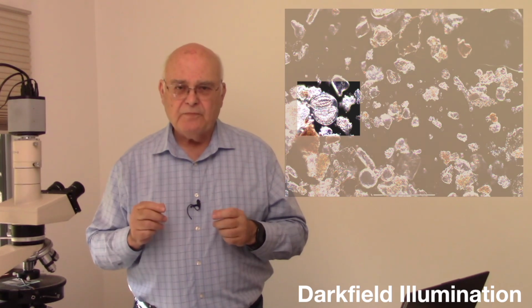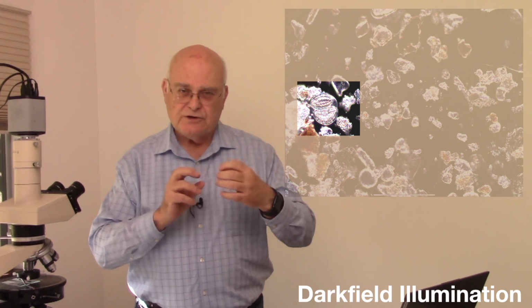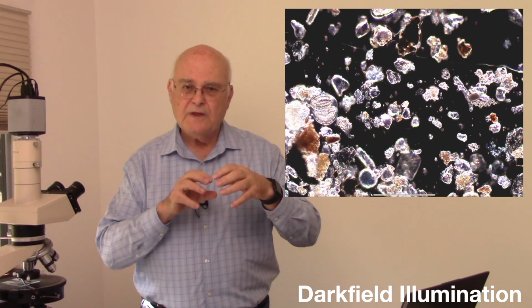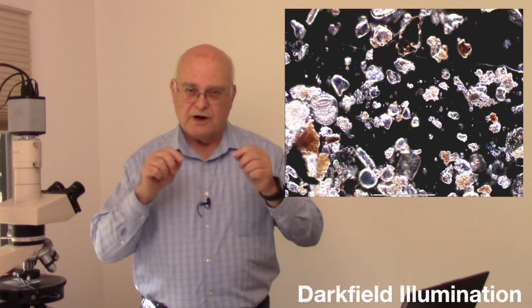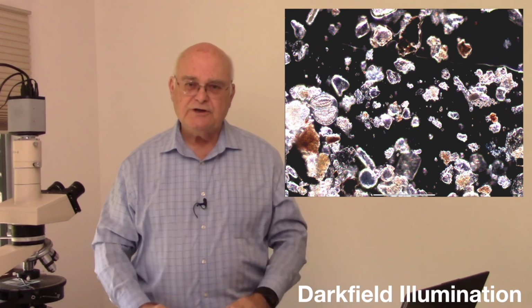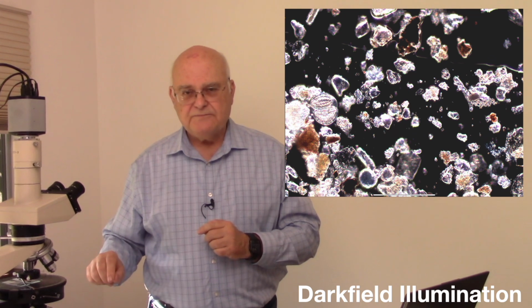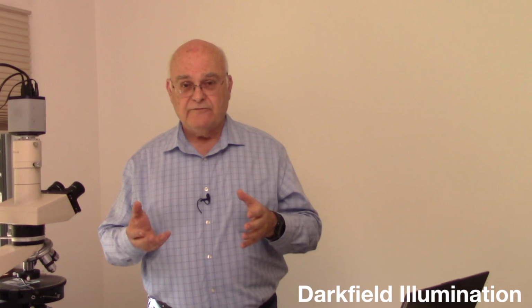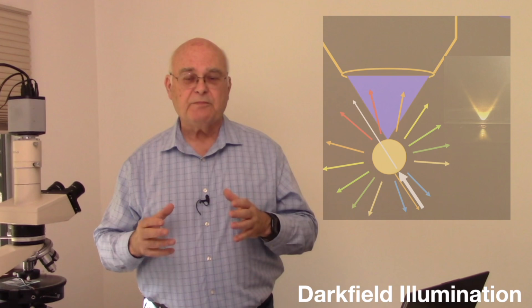You can see here that we're getting a nice bright image of the fine structure in the pine pollen vesicles. We're getting good information on a number of the particles there. We've got nice bright outlines around the particles showing us edge detail. This is accomplished in this particular case with a 20x objective, but rotating in what's called the 40x phase stop.